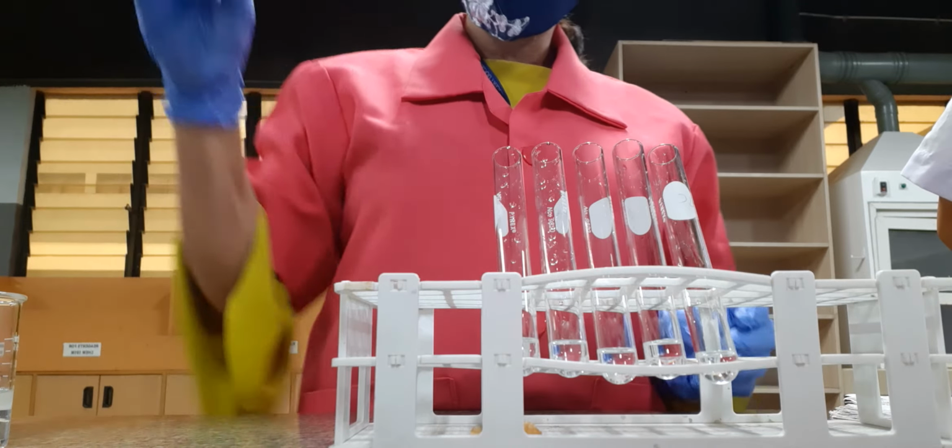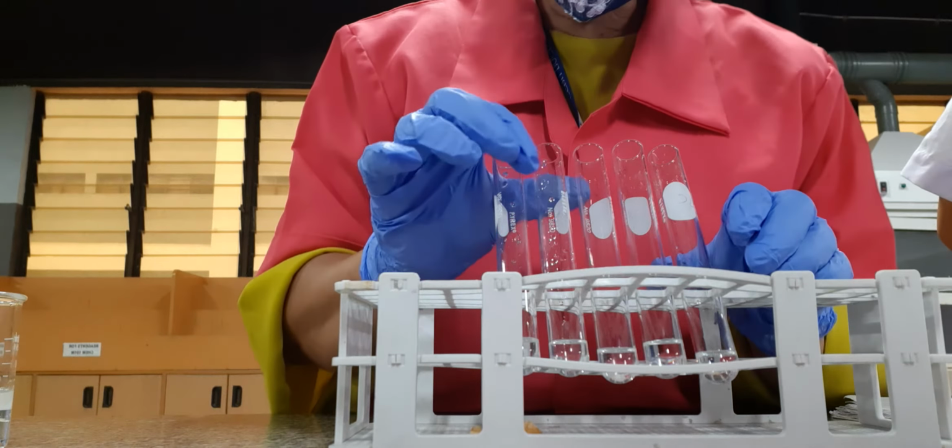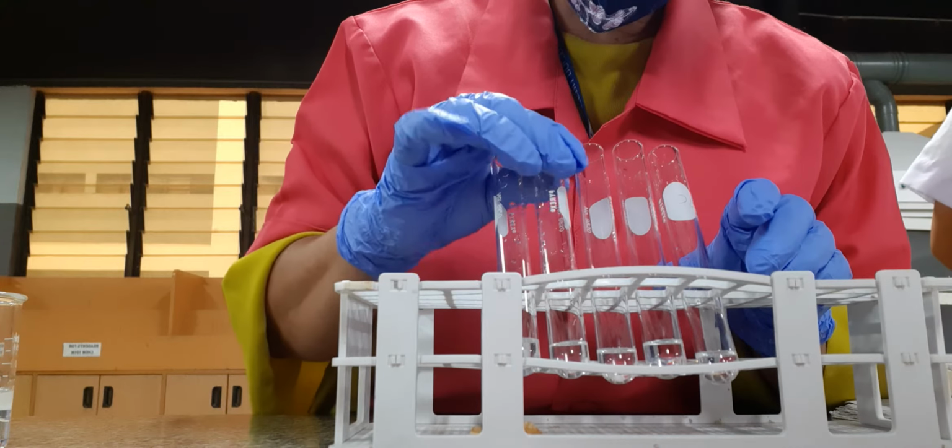Okay, so we are going to label each of these test tubes.